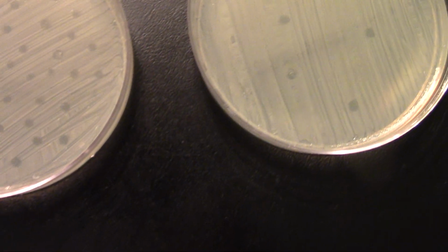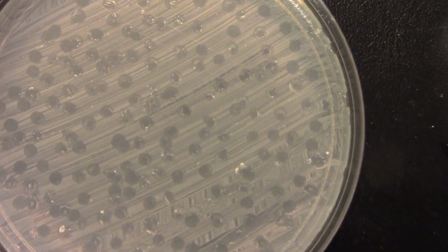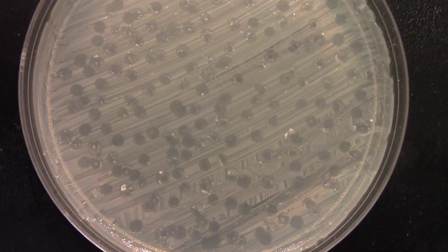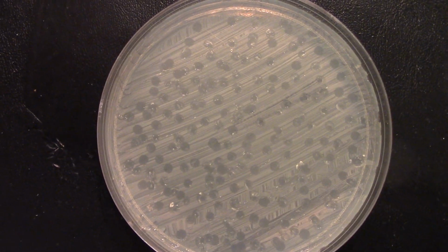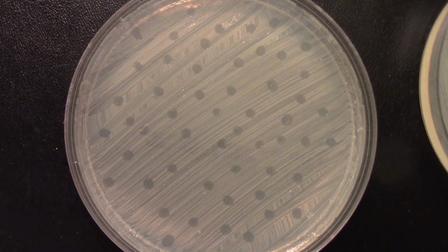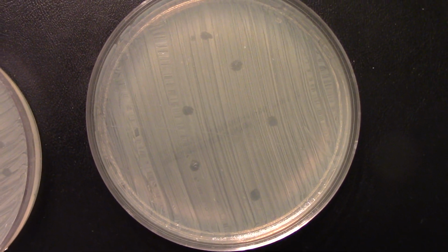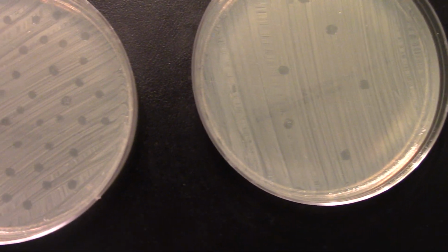So once again, we have 3 tubes that we've created overlays of bacterial lawn with the phage, and these are our plaques for tube number 2, tube number 3, and then tube number 4. So these will have to be counted to get our viral plaque assay counts. We'll have to count these plaques.